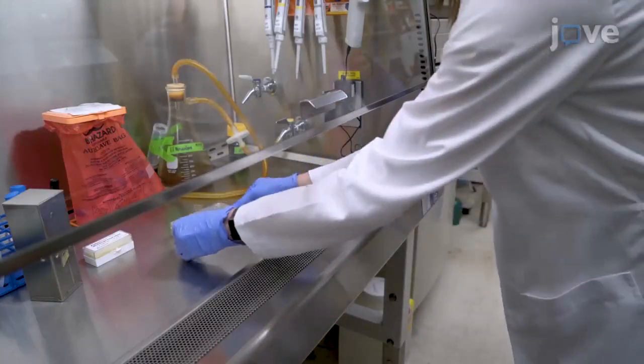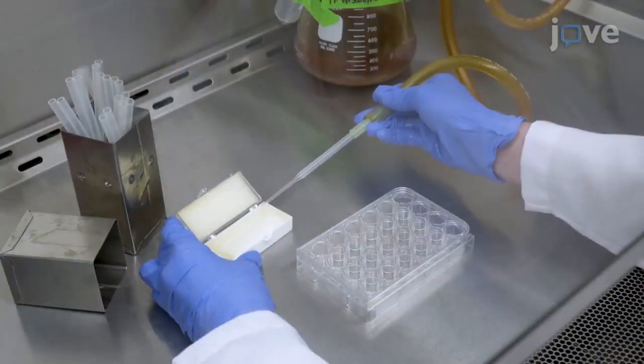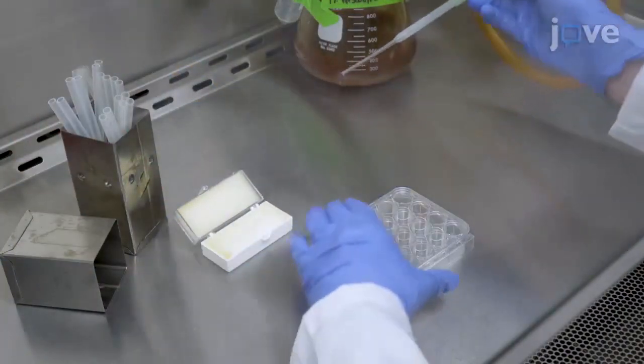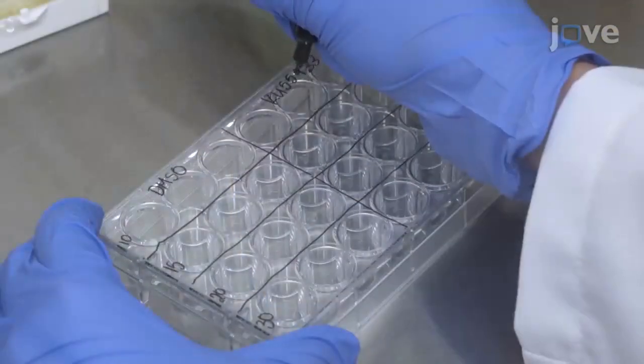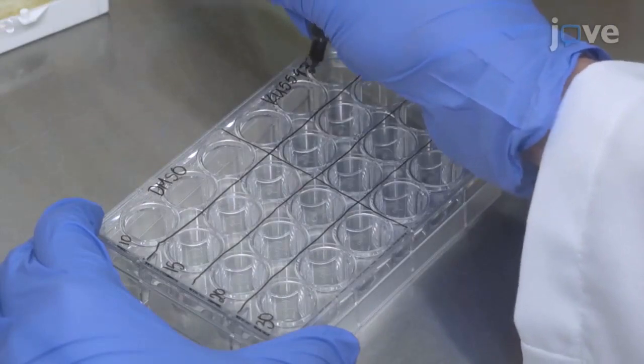In a BSL-2 certified laminar flow hood, set out a tissue culture certified 24-well plate. Place one glass coverslip into each well and label the plate according to figure 1B of the text protocol.